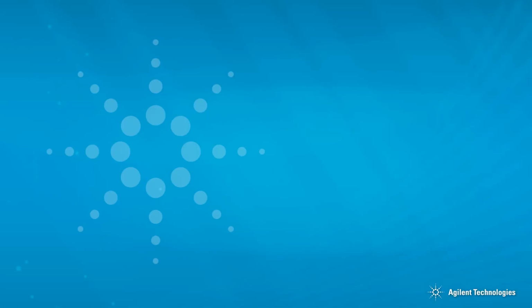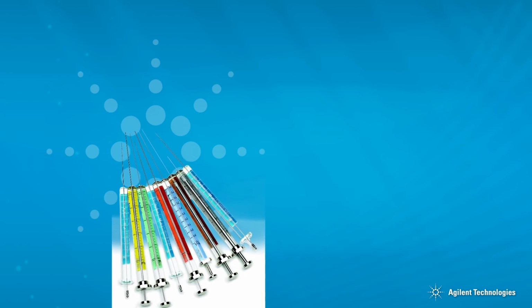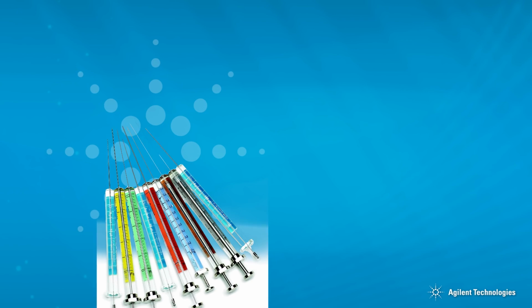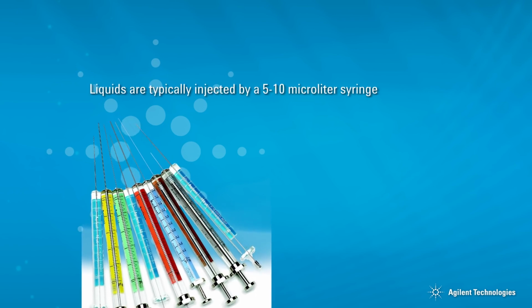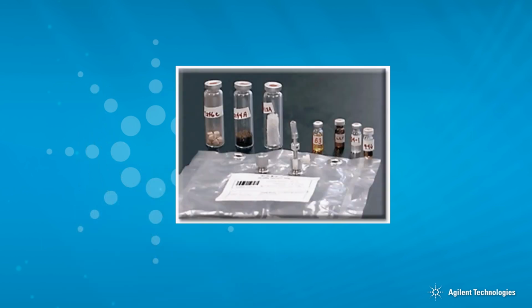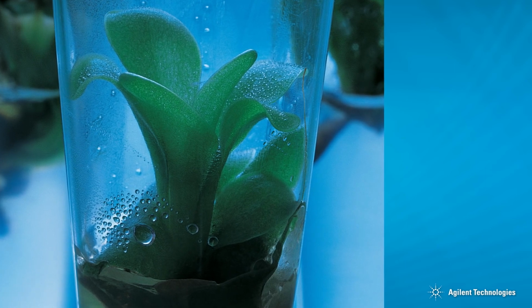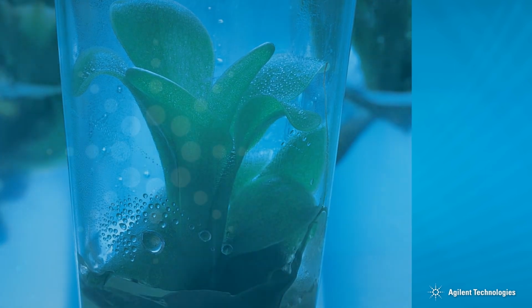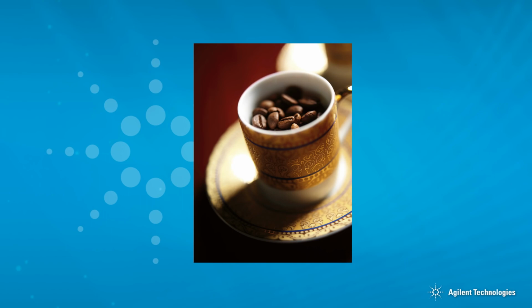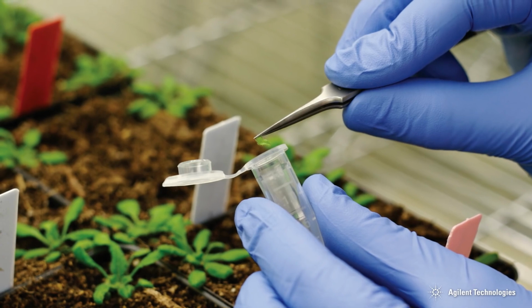Here are some other types of GC samples. Most commonly, liquids are analyzed by injecting them into a heated GC inlet or injection port using a 5 or 10 microliter syringe. Gases can be analyzed using a gas-tight syringe or a gas sampling valve. Solids can be analyzed by extracting chemicals that are in the solid with a liquid solvent. Think of making coffee. Or by placing the sample into a sealed vial and heating it up.